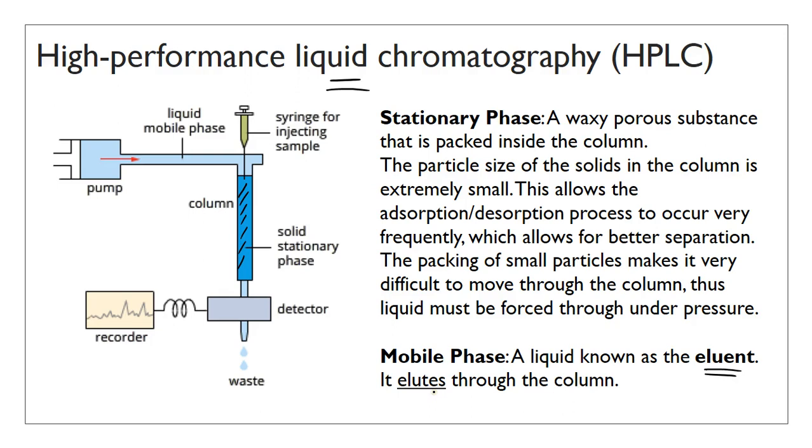But basically what this means is you can think of an example of eluting when you wash, say, your chopping board and there's food stuck on the chopping board. Let's say you just cut, I don't know, what do you cut that will stick onto the chopping board? It could be meat, or if you don't eat meat, cheese. Would cheese stick onto the chopping board? Anyway, let's say there's food stuck onto the chopping board and you run the chopping board underwater. That's what eluting means. It's basically having water running through a surface, and that water is going to carry any of the bits off the surface. So that's what eluting is.